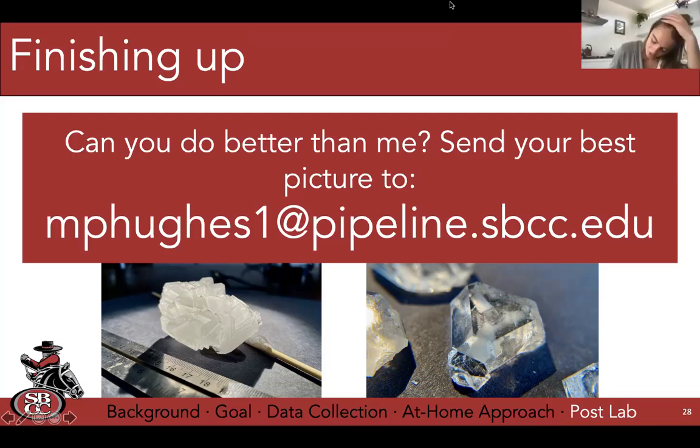Sorry, Michael, just one question. Do you think if I start tomorrow, I'll have enough time, or if I do my crystals today, and then I let them cool, and then tomorrow I play with getting them bigger? Is that okay? Perfect, perfect. I think you can do everything in 1 week. Remember, I grew mine in 1 week. It's a baseball size, and I change the water only once a day. You could change the water twice a day and really probably shorten that up to 3 or 4 days worth of work.